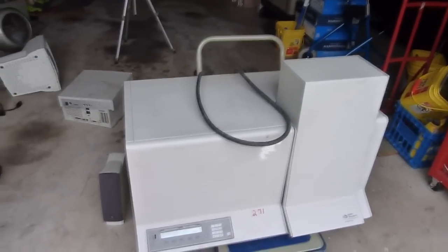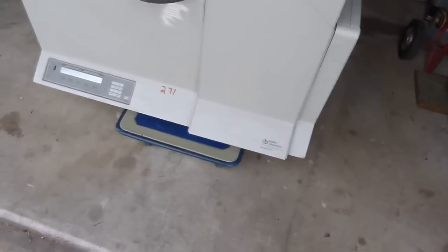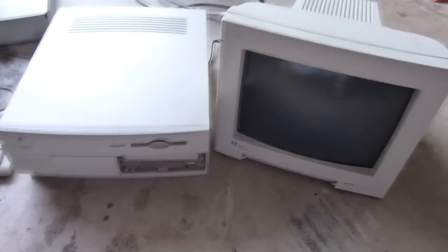Today I thought I'd take a look at one of my recent eBay finds. It's an Applied Biosystems 373 DNA sequencer. The system came with an old Apple Power Mac system, so I'm going to see if I can get that up and running first and see if it still has the DNA sequencer software on it.